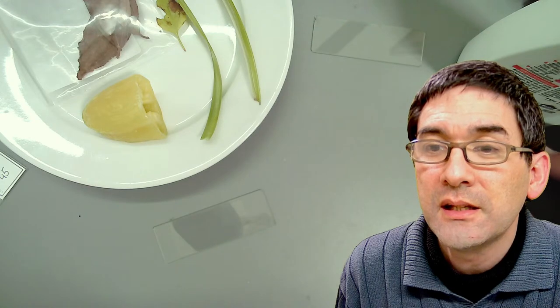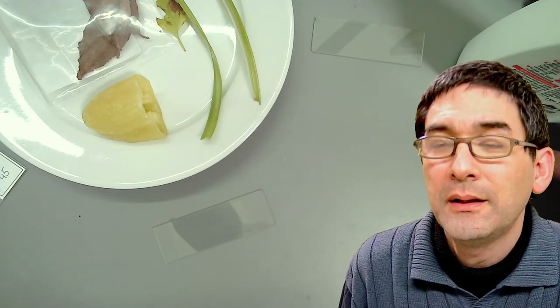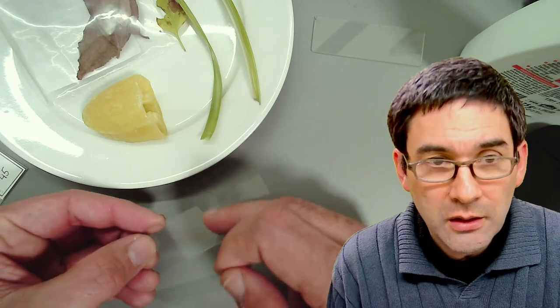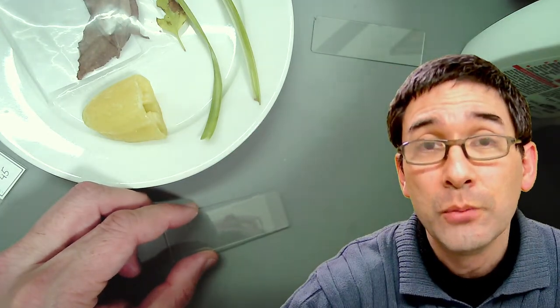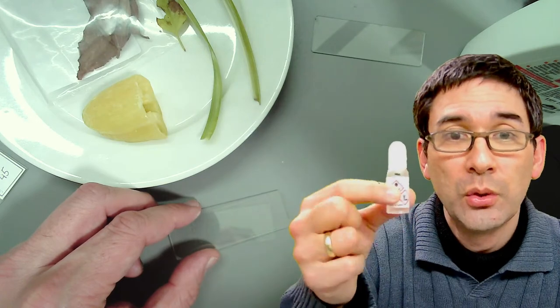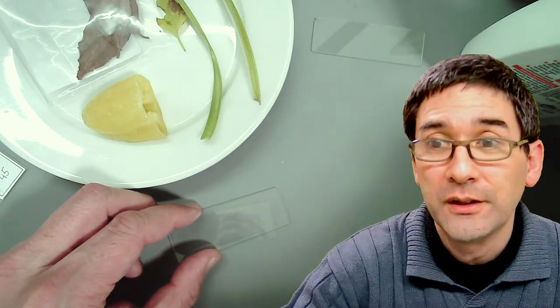Would vegetable oil damage the lens? What I meant — and this is really important — you can use vegetable oil beneath the cover glass as a mounting medium, but do not use vegetable oil instead of immersion oil. Immersion oil goes between the lens and the cover glass — that's something completely different.